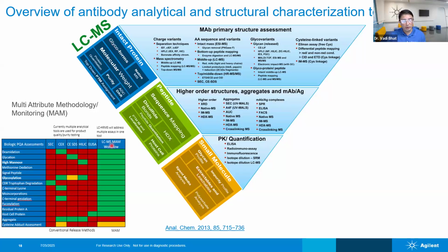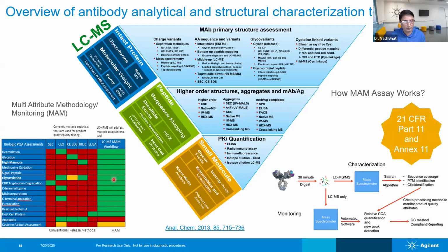Now, with mass spectrometry, many of these tests can be combined in one instrument. To make it more economical, you reduce the HPLCs and add more mass spectrometry. As I mentioned, simple mass spectrometry like single quad mass specs can do much of this work, so you don't need high resolution mass spectrometry for routine analysis on a given day, unless you want to do a deep characterization on a daily basis.